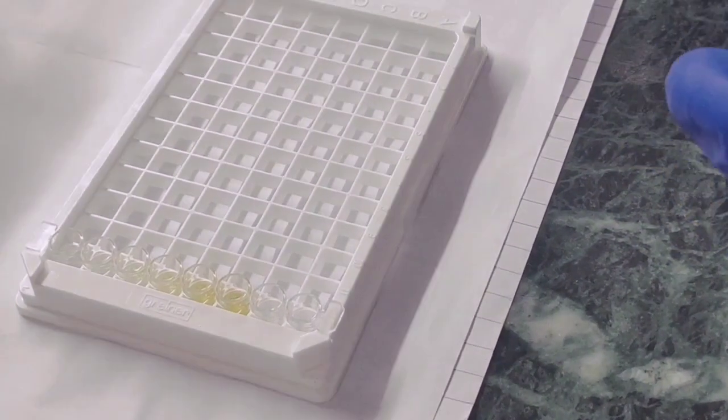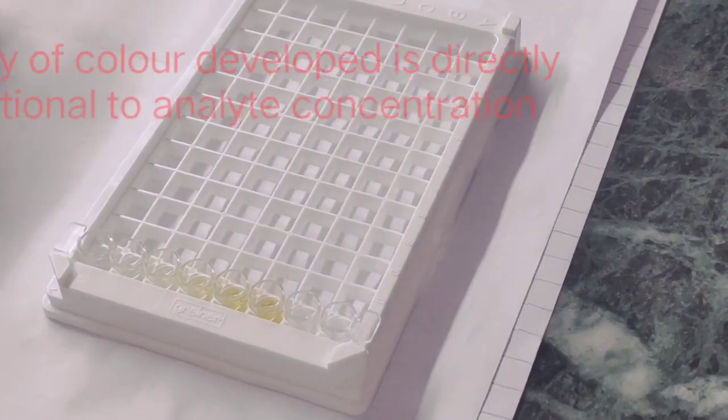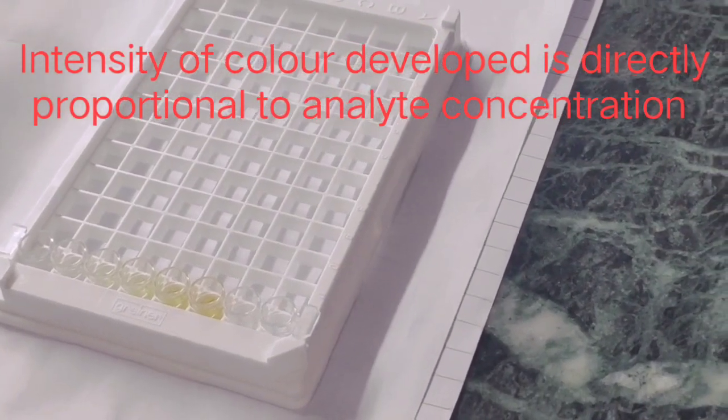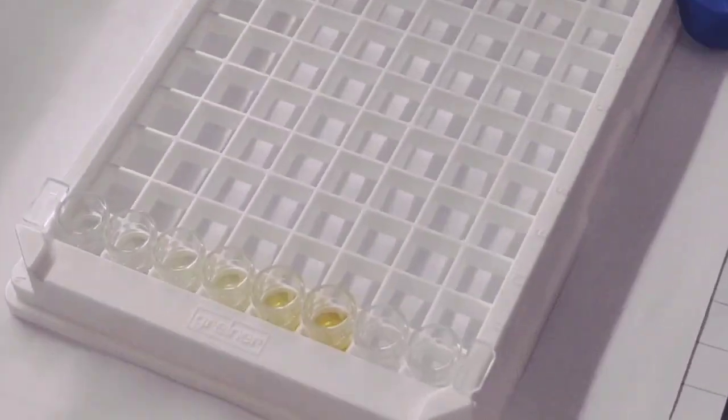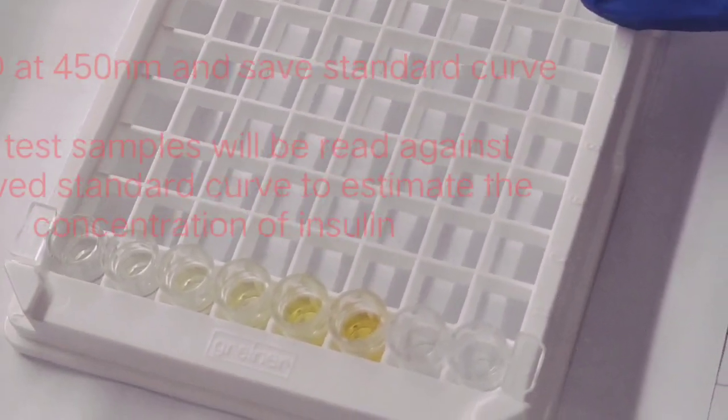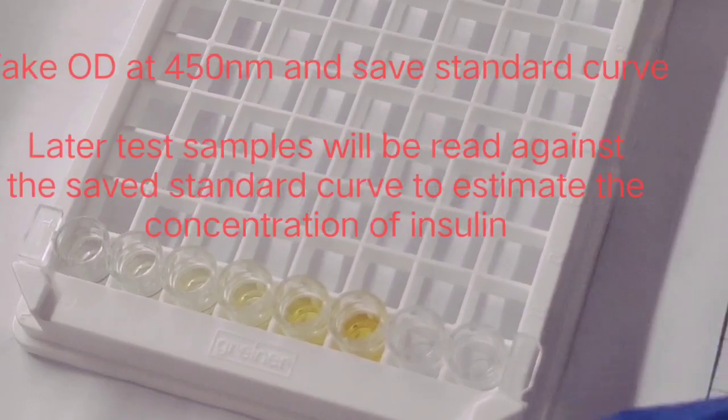As you can see, the intensity of the color developed is clearly visible. We'll also take the OD in a spectrophotometer and we'll make the standard graph according to the OD that we get.